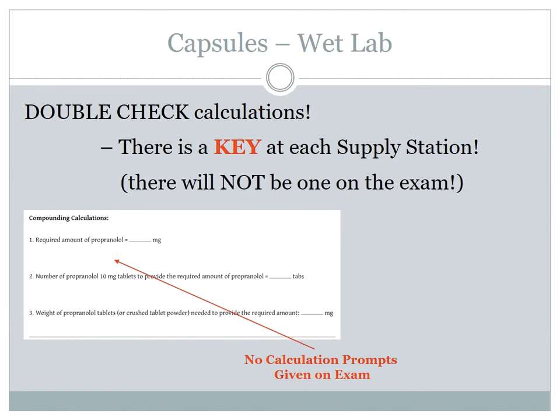Let me just say this though, because the propranolol is from a tablet. We didn't show you a tablet. The one thing I'll say, and this is not the right number, you're going to do your own calculations, but it does turn out for propranolol that you need an even number, a whole tablet. So let's just say 7. You need exactly 7 tablets. That's not the right number, but let's just say you will be exactly the right same full tablet, 7 tablets.